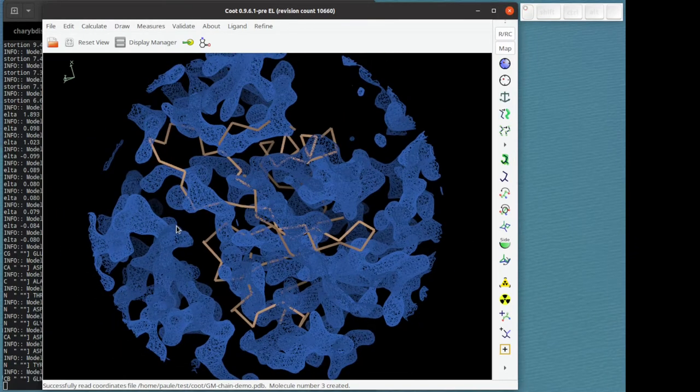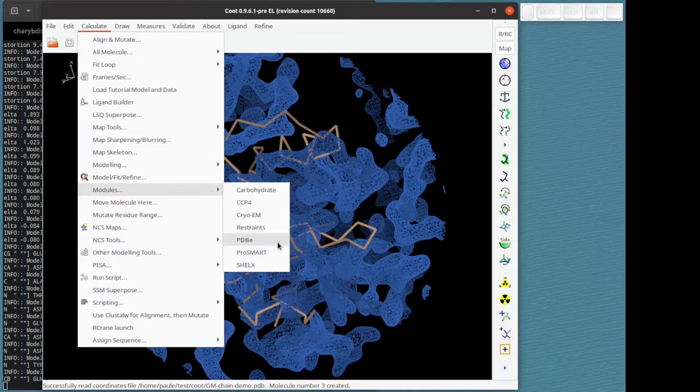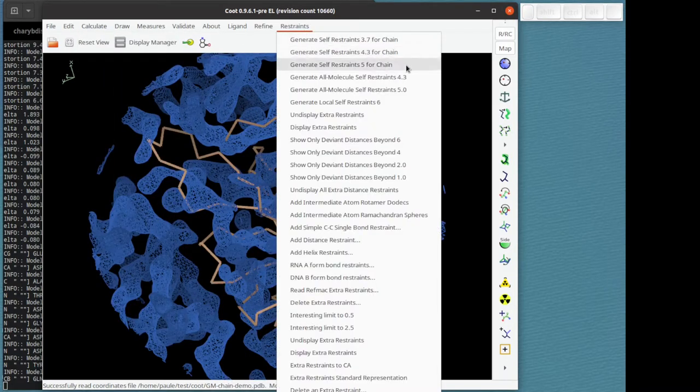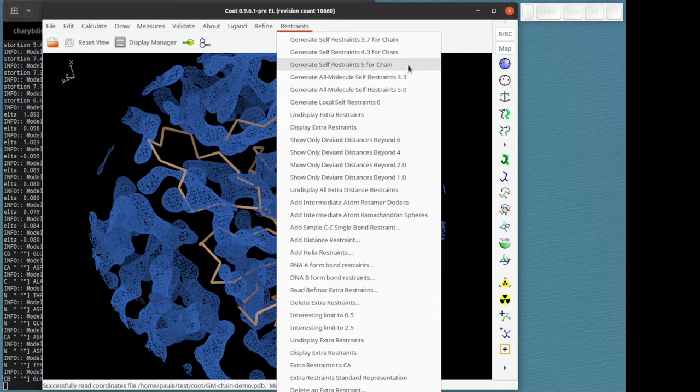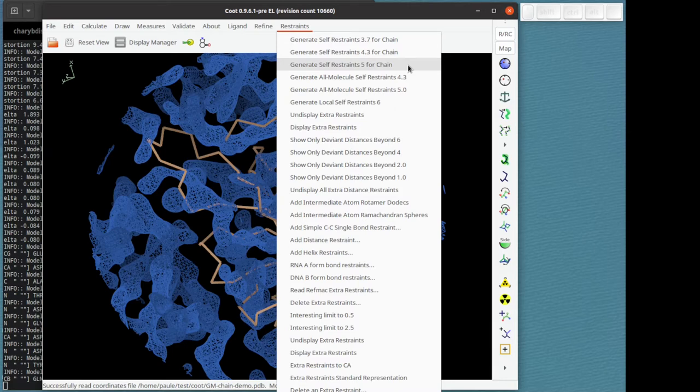Now we're going to turn on the restraints. Calculate modular restraints. The target distances are those of the reference model. For a more sophisticated set of distance restraints one would use ProSmart, but for now for this example we can use self distance restraints. So five means five angstrom. That is the cutoff for the distance of what's considered the local environment.